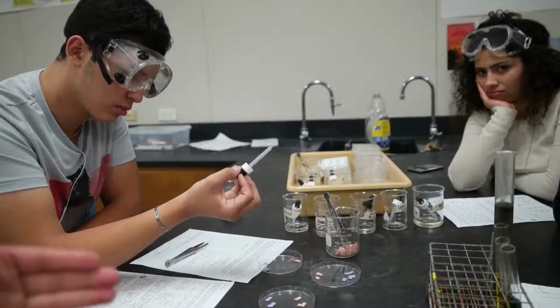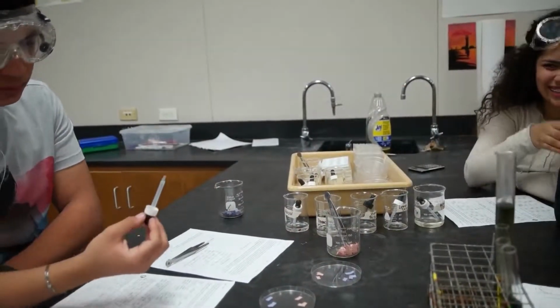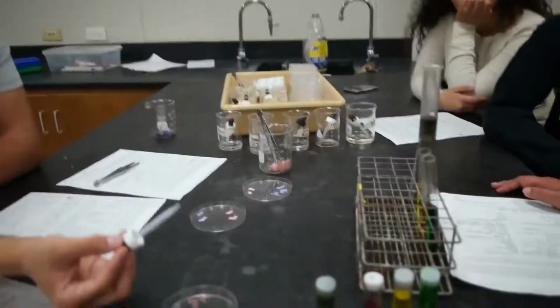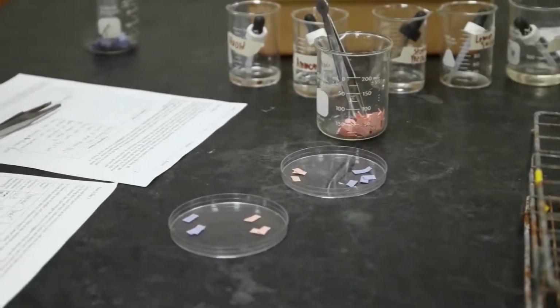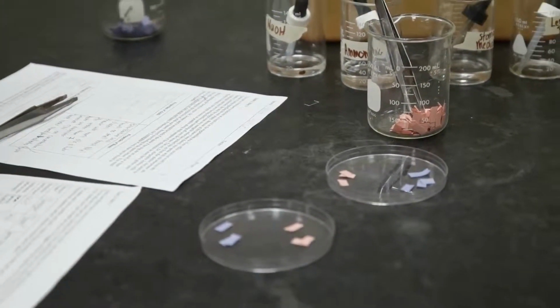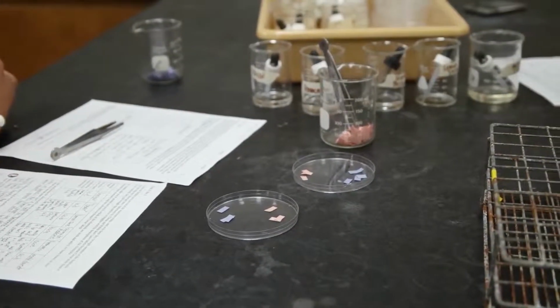Can you bring this closer to the camera so we can see? And since ammonia is a base, the red litmus paper turns a shade of blue. And that's how we can tell that it's a base. So that was just to test if it was an acid or base.